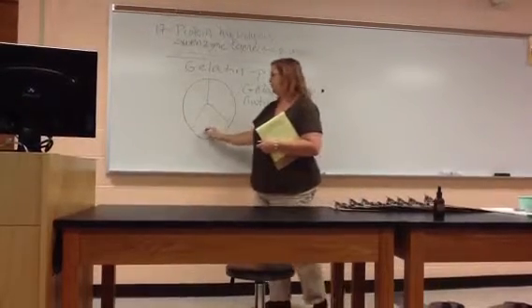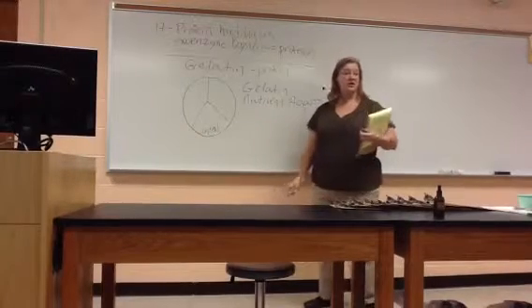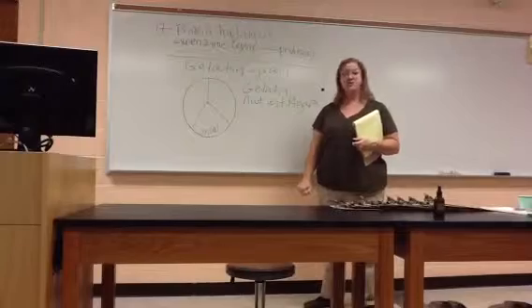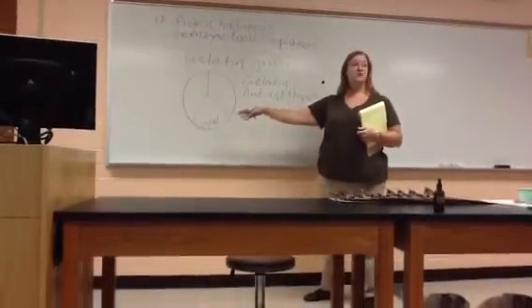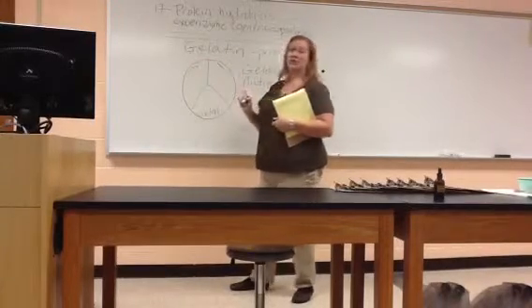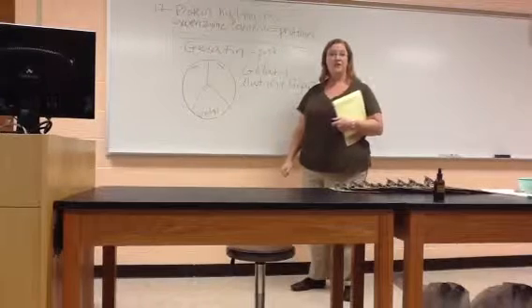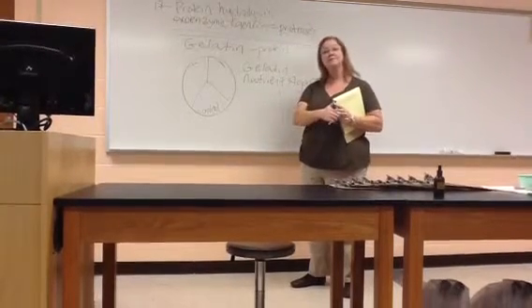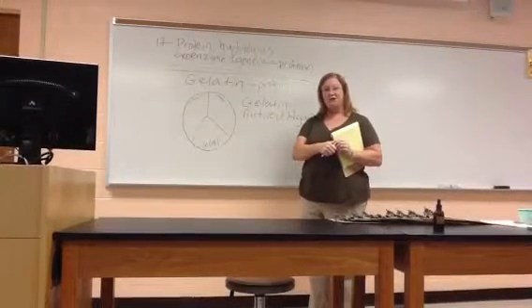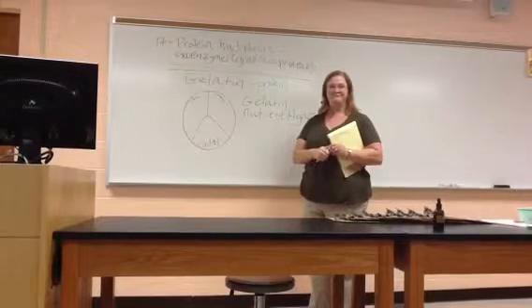Got a control section. You've got to read your lab book to see which 2 bacteria you need. If you look at your materials page, there are going to be 3 bacteria listed. You're not using all 3. You've actually got to read your procedure for this one to see which 2 bacteria you're putting in the gelatin plate, so that you know later. Do we need to know each one of the bacteria for each one of the tests? No, I'm never going to ask you which bacteria did you use for the starch test or the gelatin test.